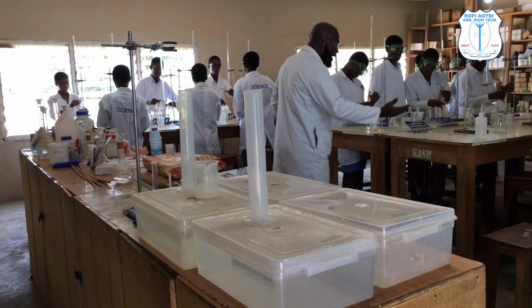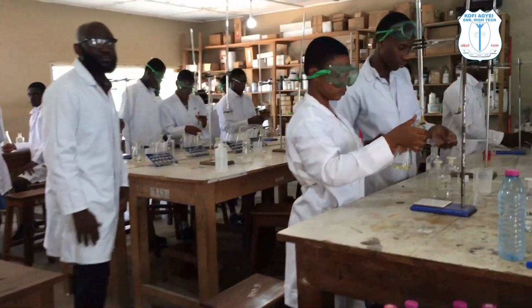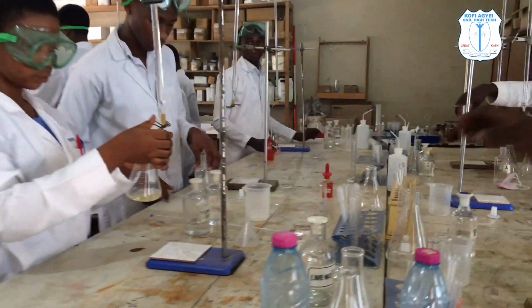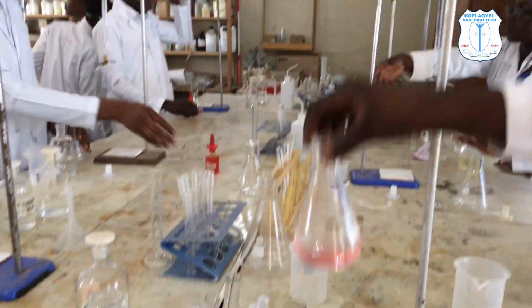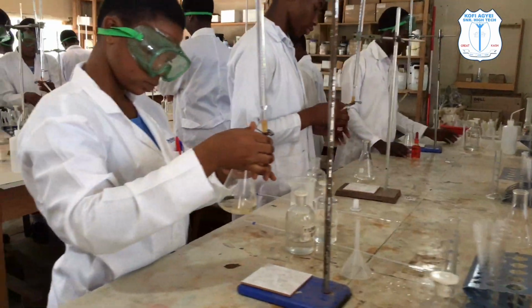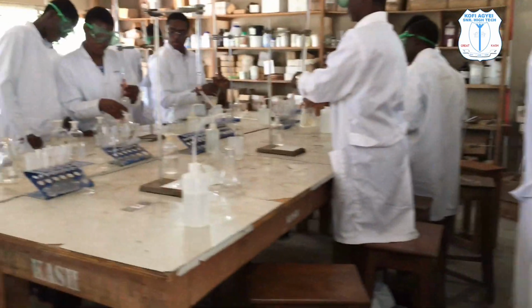Now, gentlemen, once you get to the color change, that's the end of the titration. You also got the color change, from yellow to pink, right? All right, so that's it. Now, gentlemen, you need to wear goggles. Correct.